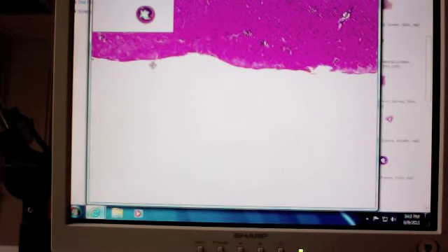Would you say be specific, or would you just say what kind of? If I'm saying to you, name the epithelium on the outside of this organ, I do not have to say be specific, because I'm telling you it's on the outside of an organ. All right? If I just say, name this epithelium, and I'm not saying anything else, for all you know, this is a ginormous blood vessel, and we're sitting in the lumen, okay, so it could be an endothelium. Simple squamous epithelium would be fine. All right.